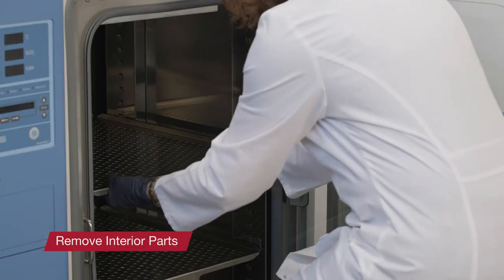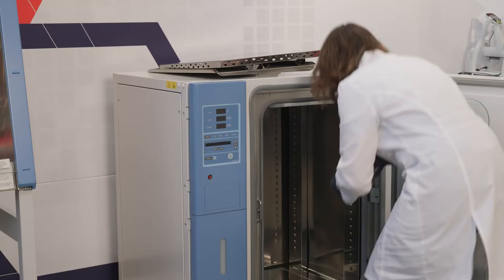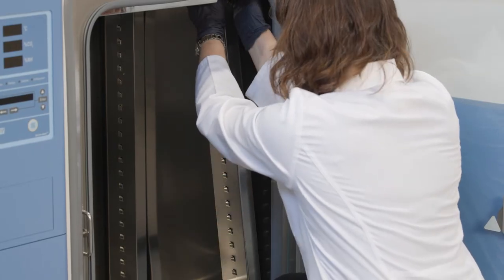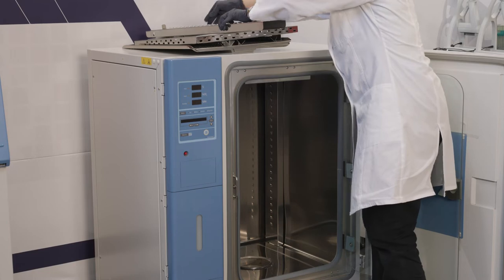Remove the shelves, shelf supports, and shelf rails, and set aside for later cleaning, or if you prefer, send them to the autoclave for sterilization. Aside from regular maintenance cleaning and disinfection of the incubator, any spilled growth media should be cleaned immediately to eliminate the chance that microorganisms could grow in that area.